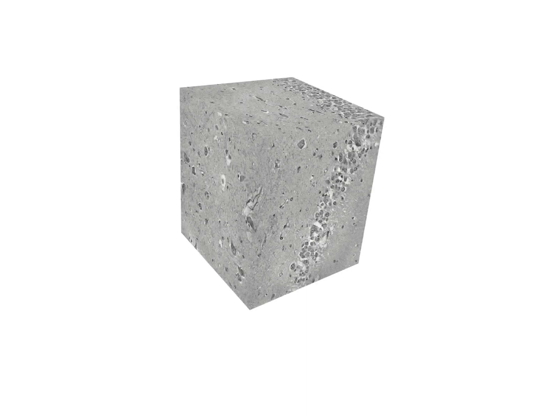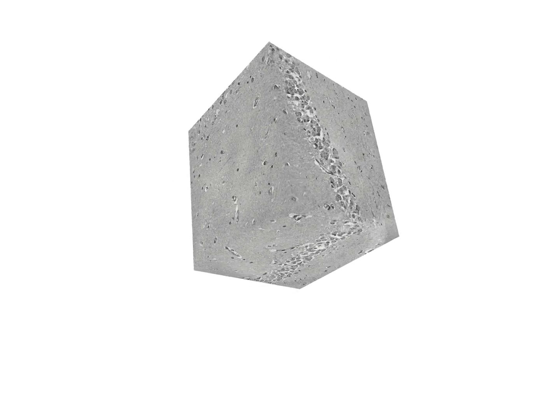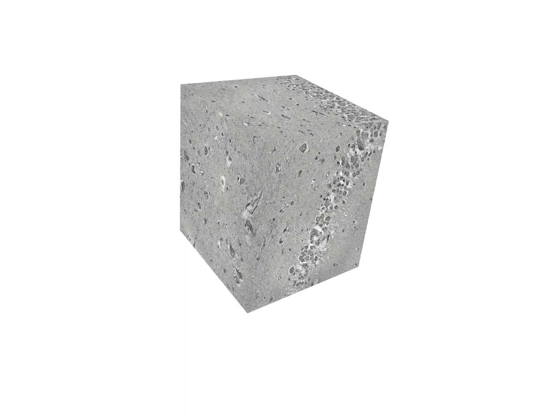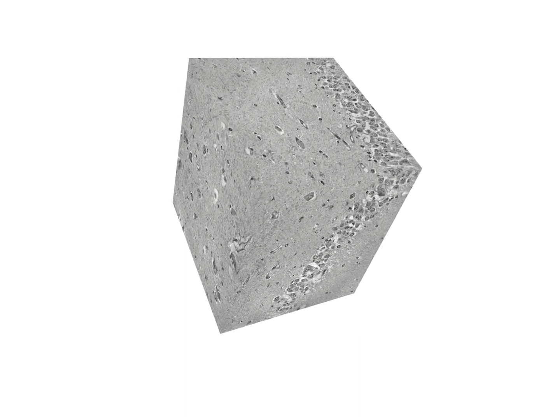Professor Salditt's group is specialized in phase contrast X-ray tomography. This is a modern technique to obtain high-resolution 3D images of sensitive cell tissue samples. In the animation, you can see a part of the human hippocampus at a resolution of approximately 200 nanometers. One can recognize individual cells and even their substructure, such as the nuclei.